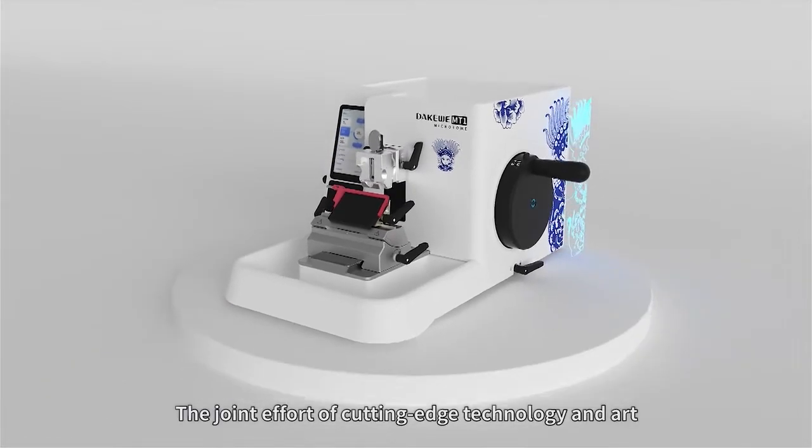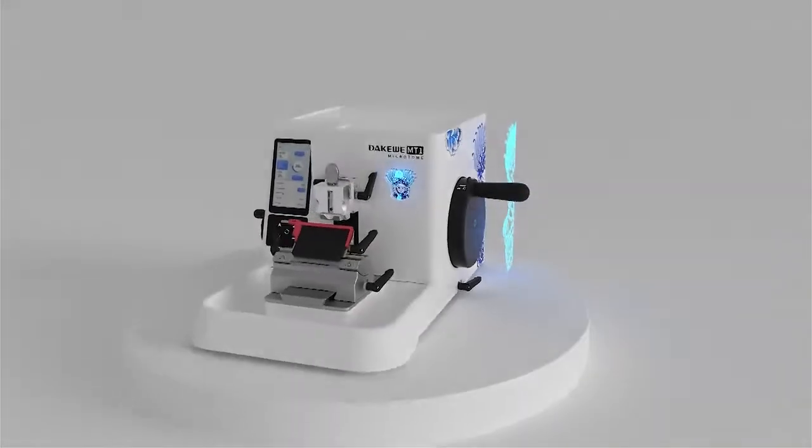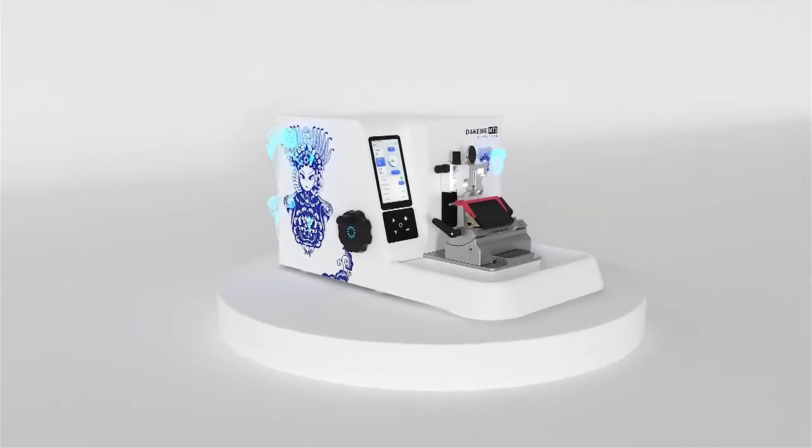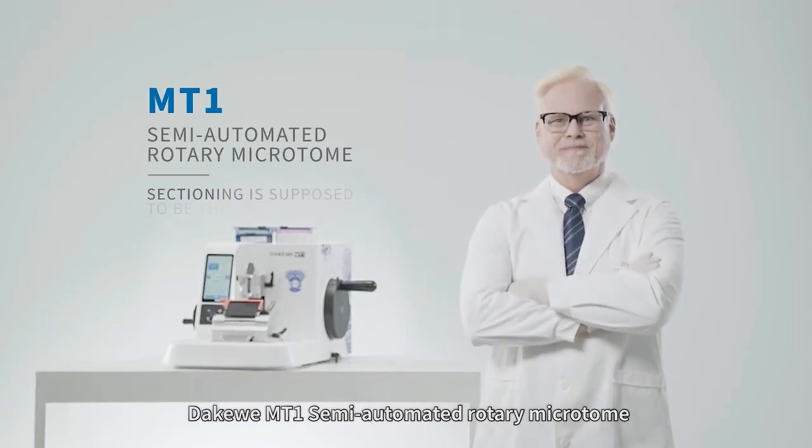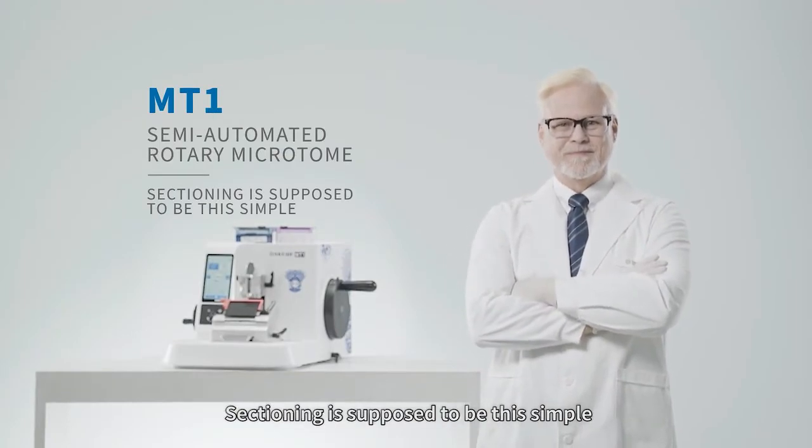The joint effort of cutting-edge technology and art — Dakewe MT1 Semi-Automated Rotary Microtome. Sectioning is supposed to be this simple.